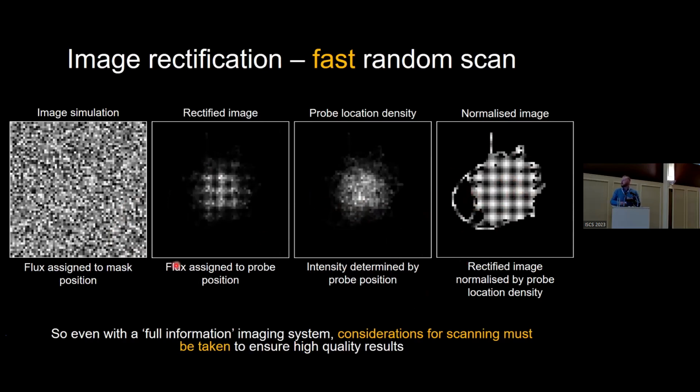The point being here, if you can access these probe locations, you can be really crafty in how you can form subsampled images. You can imagine instead of doing something like this, where we're visiting every location, we actually scribe lines through the image as a function of the probe moving. And that's how we form our subsampled images rather than visiting a subset of pixels. We think about the pathway of the probe as opposed to the fixed locations of the probe on the discretized grid.